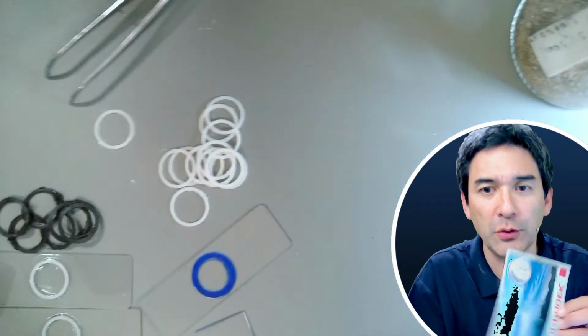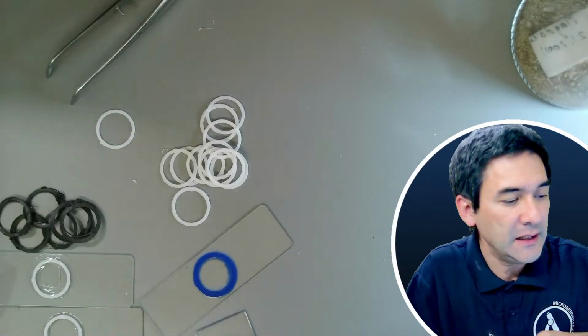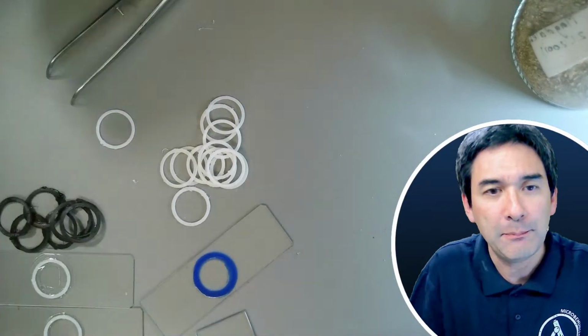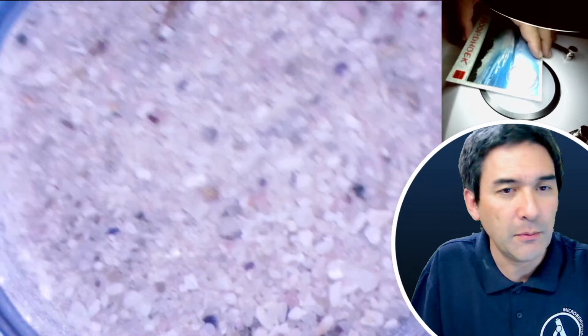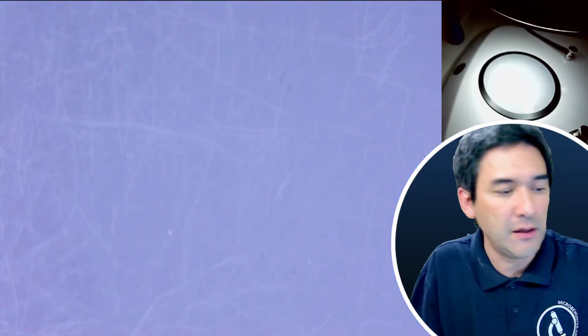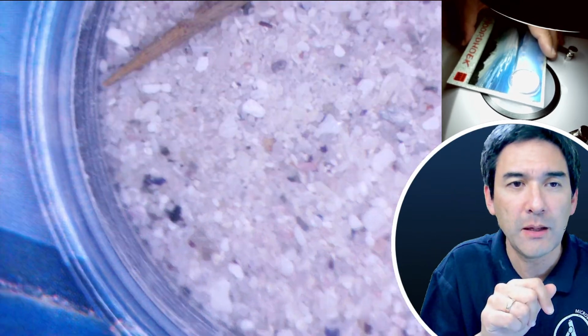The one that I've got over here is for tourists, which was sold. And those sand samples can of course be directly put under the microscope. I'm going to show this to you right now first, and then I would like to experiment a little bit, making some of those slides. So you can see on top here my stereo microscope.